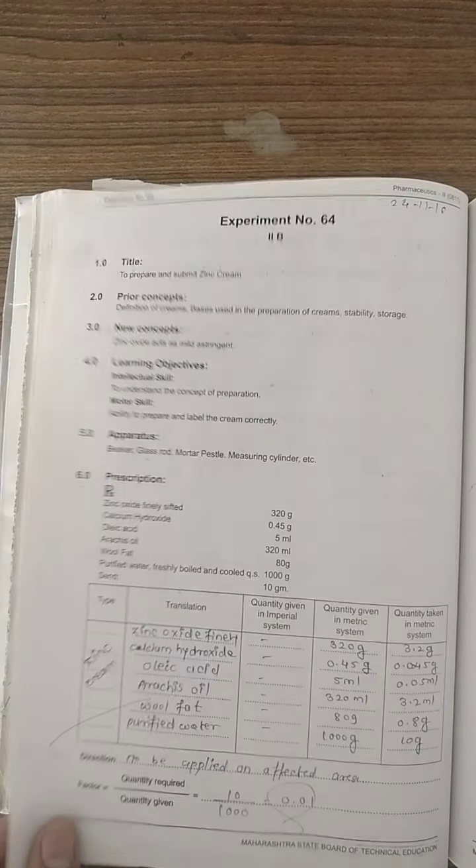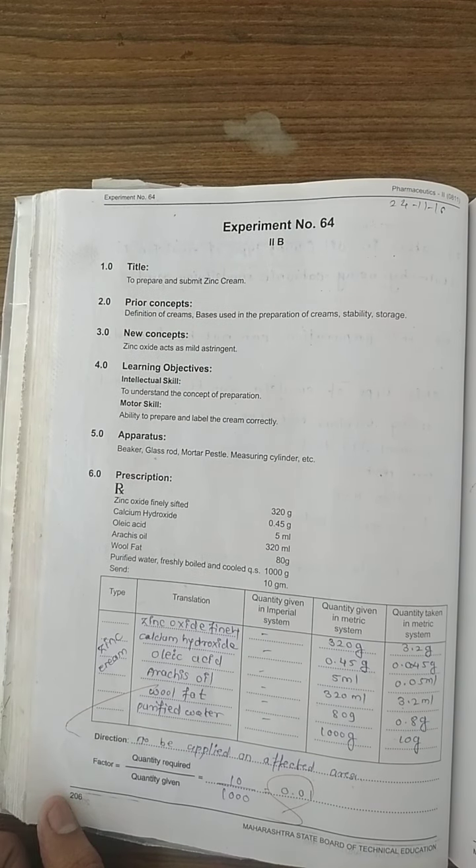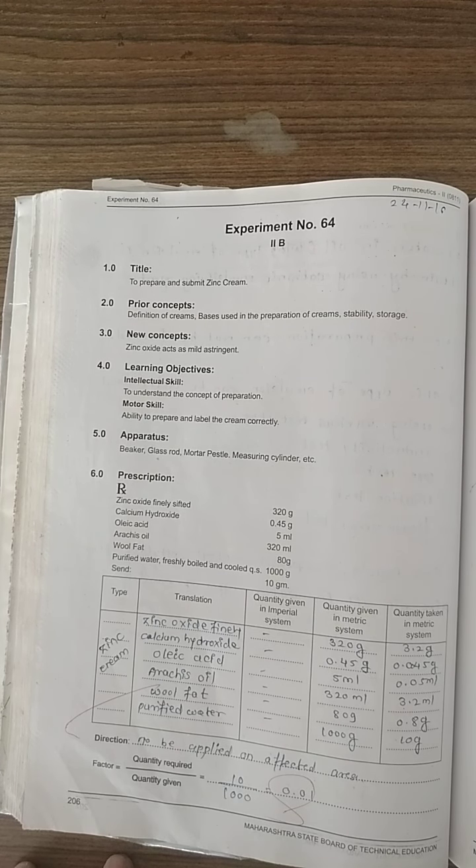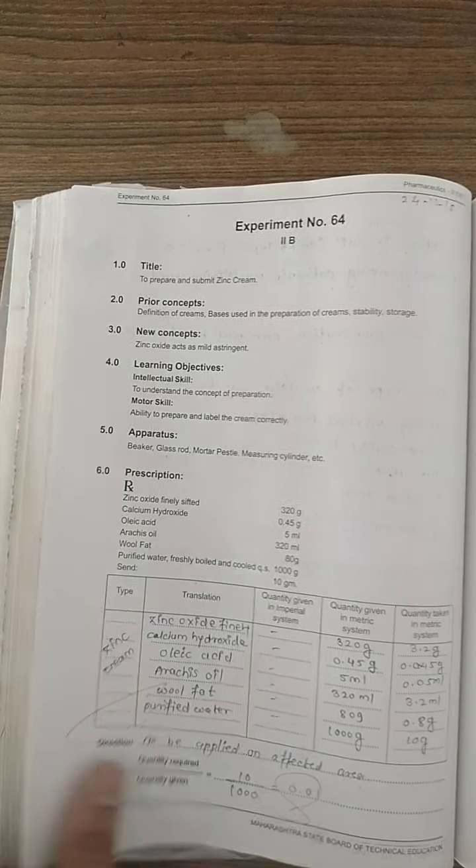The next is experiment number 64 — zinc cream. The ingredients are different: zinc oxide finely sifted, calcium hydroxide, oleic acid, arachis oil, wool fat, and freshly purified water up to 100 grams. We follow the same procedure as experiment number 63, but we need to make 1000 grams scaled down to 10 grams.